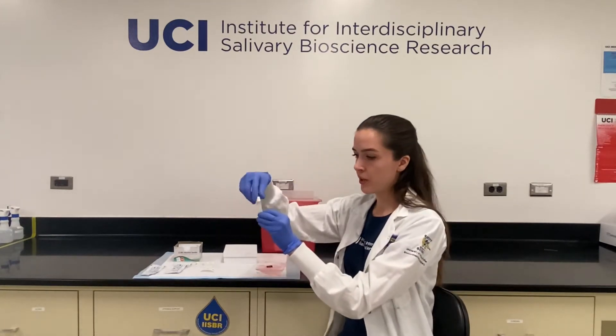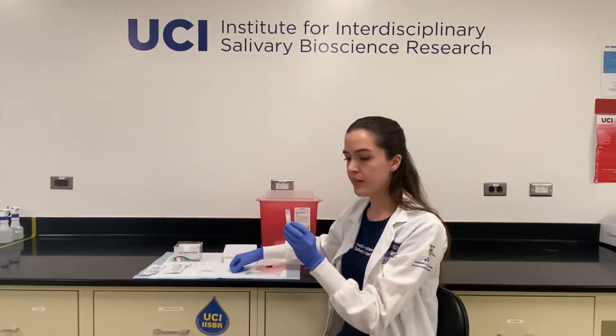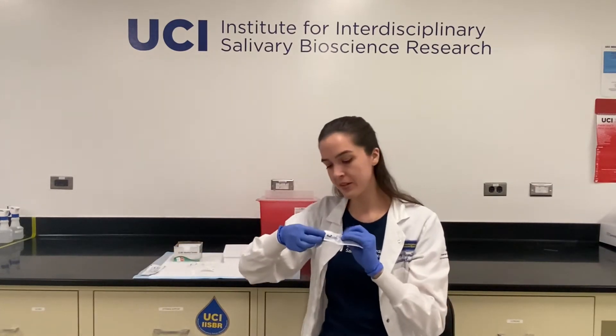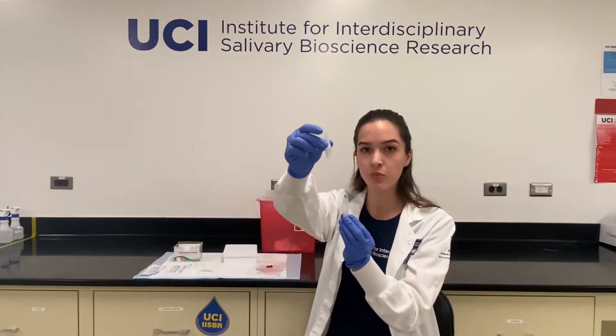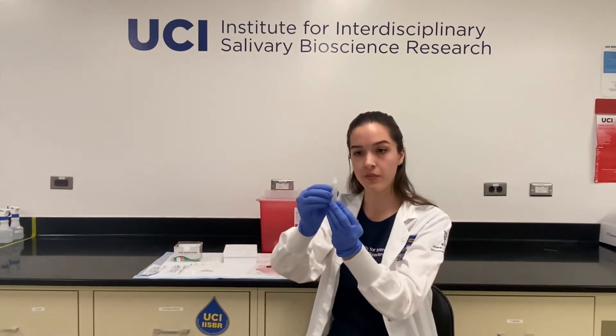After that, you can uncap your tube and place the cap up on the countertop. You can then take your straw and put it into the tube, or if you're using a saliva collection aid, take it out of the foil package and place it into the tube so that the end with ridges goes into the tube and the smooth end goes out of the tube.